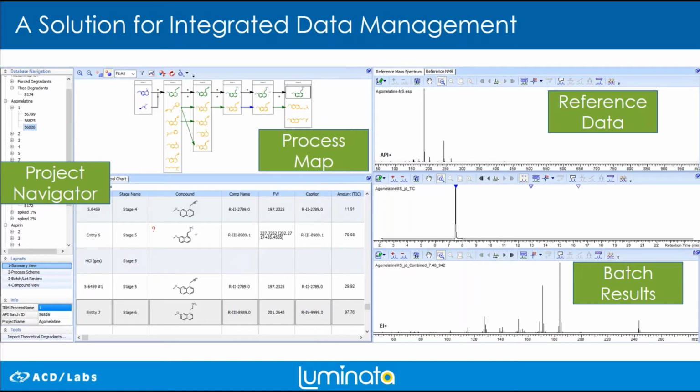That becomes quite difficult for any user in Pharm Dev. Now, finally, in the central location, your batch data tables. We have two different tables, and I'll go through it when I'm showing the software. You'll have an entity table that really looks like Excel, full configuration where customers are used to adding different columns, different headers, and placing that all together.